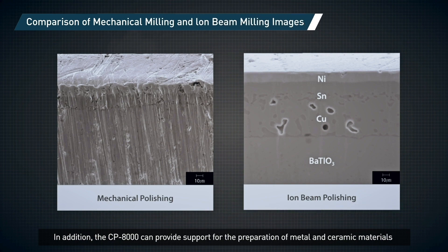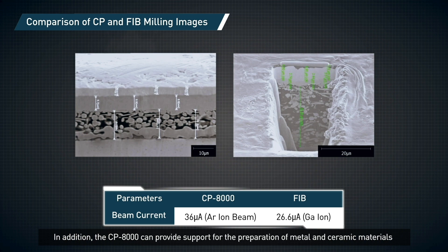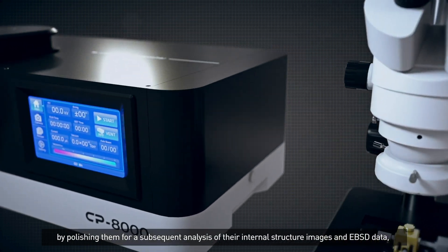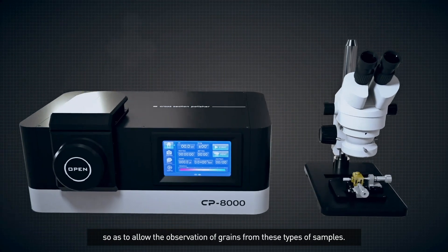In addition, the CP8000 can provide support for the preparation of metal and ceramic materials by polishing them for a subsequent analysis of their internal structure images and EBSD data, so as to allow the observation of grains from these types of samples.